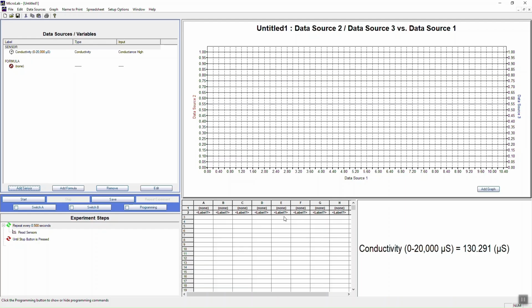Now you'll recall that this is in tap water. If we have DI water available, excellent, it'll read lower. But if we have tap water, it usually reads between 50 and 200, somewhere like that. In this case, it's reading about 130, and it'll change based on the Microlab and based on the day of the week. So I'm going to minimize this again and try to get you a screen of the Microlab and of the live view. Note that this is where we're reading the conductivity.